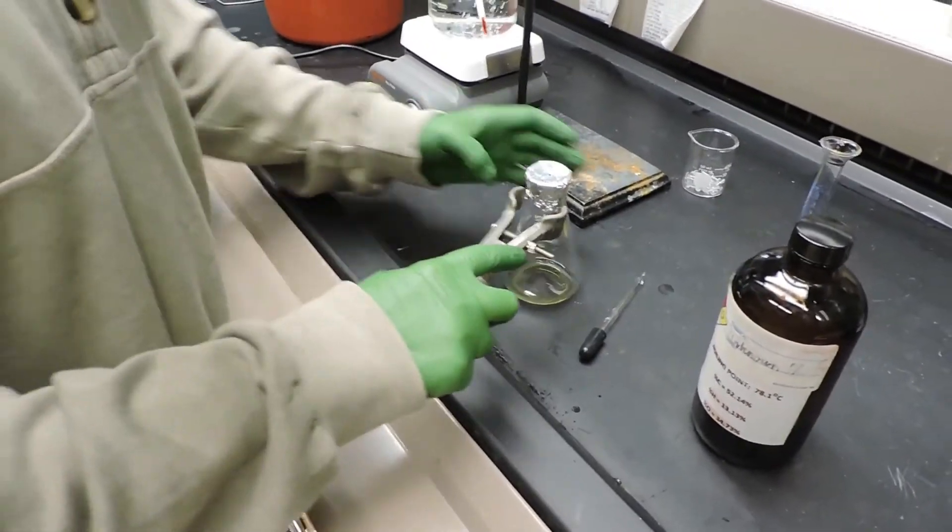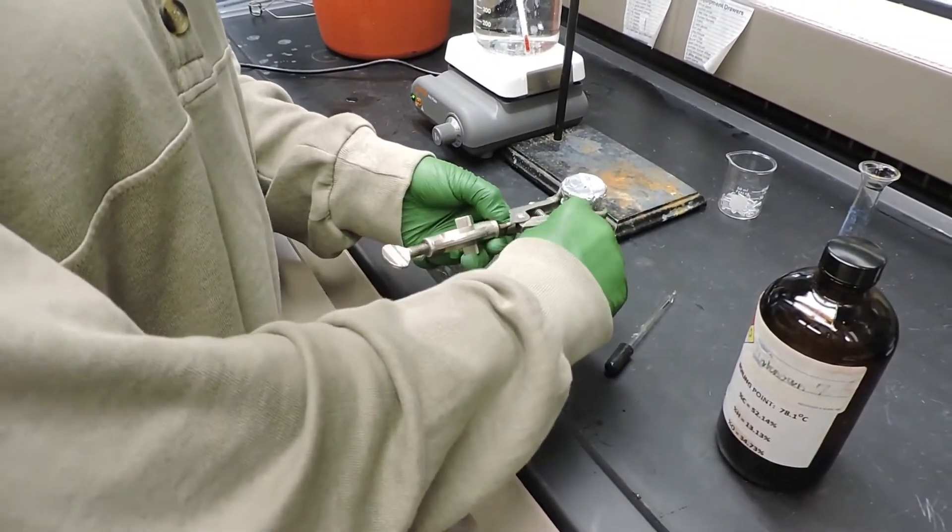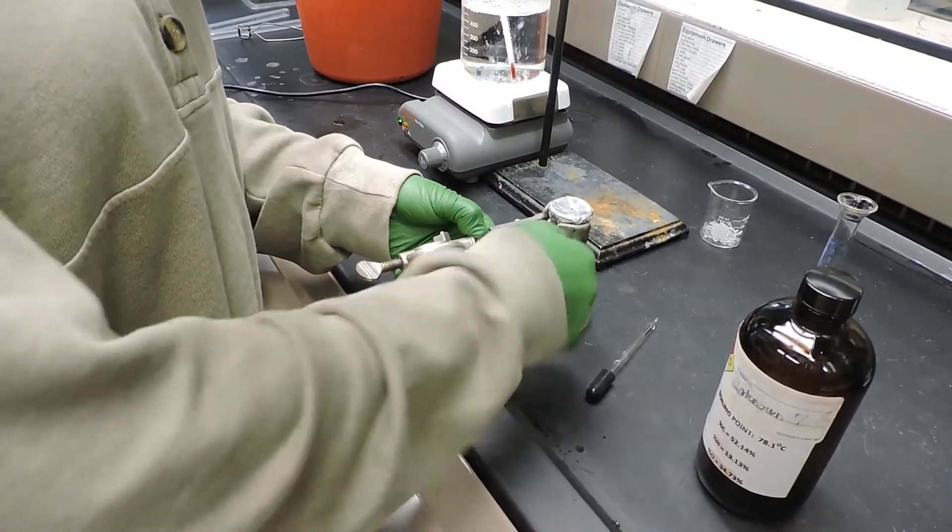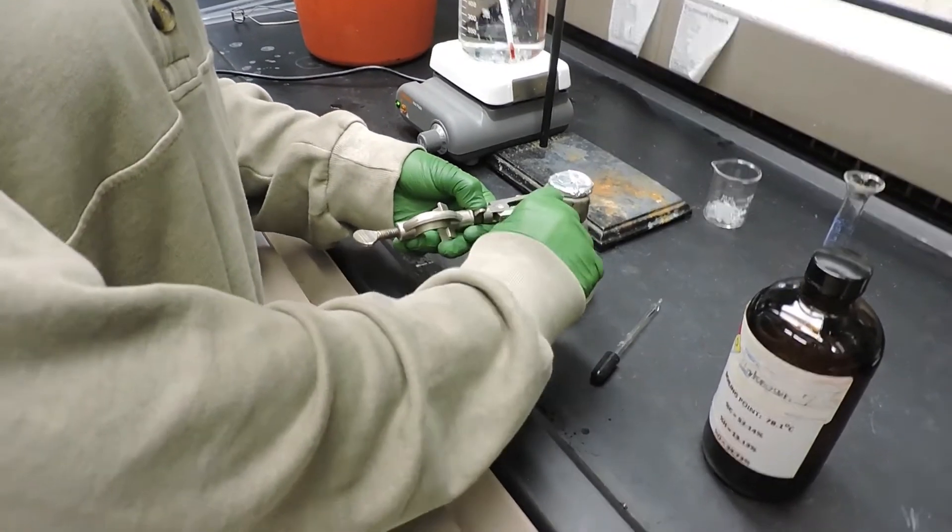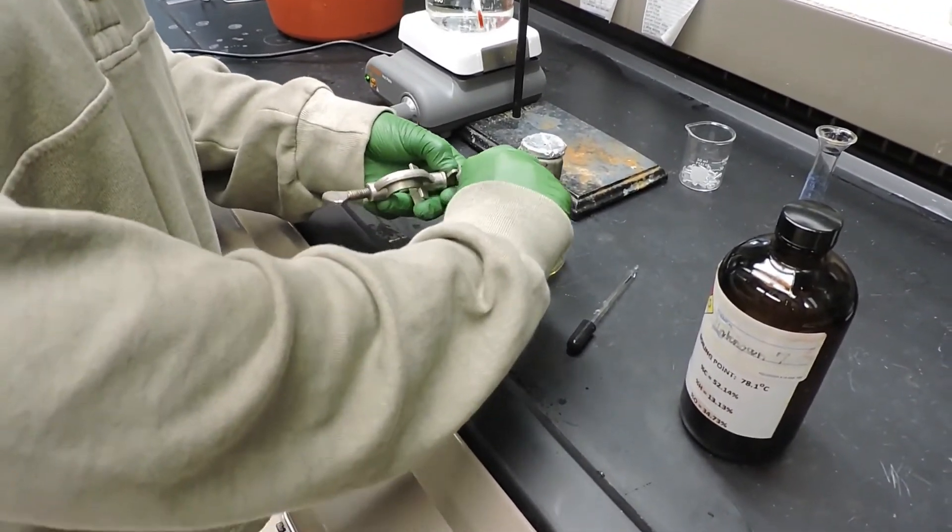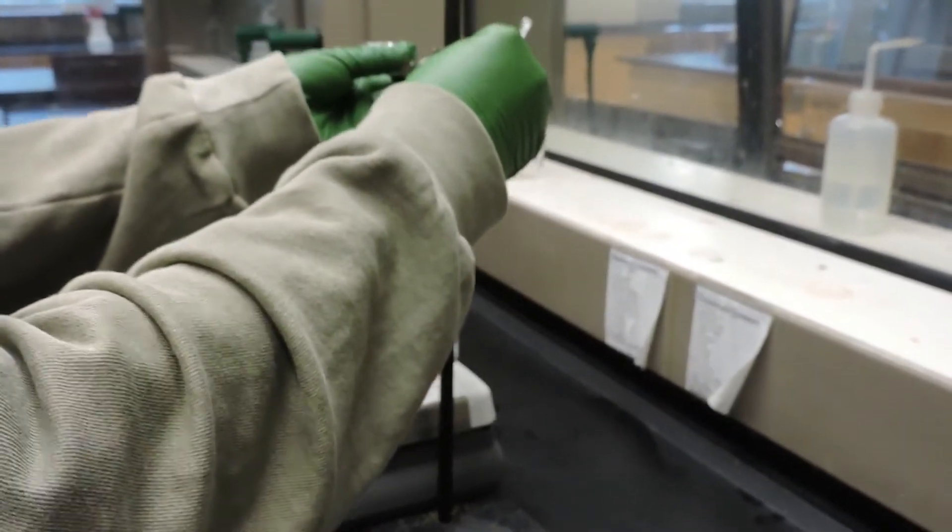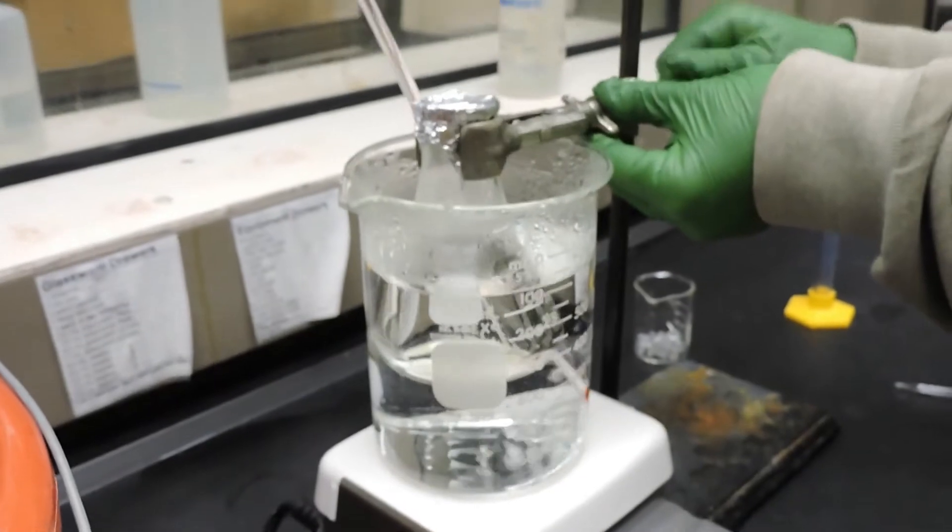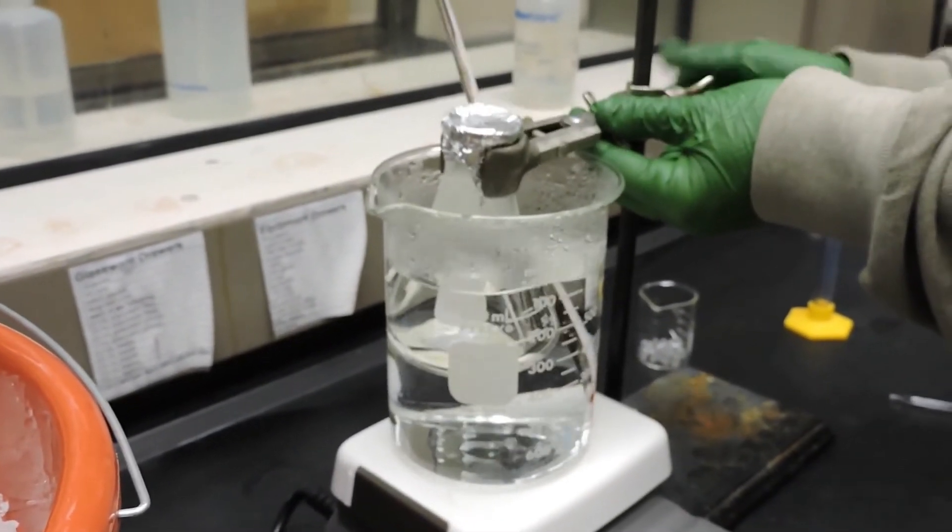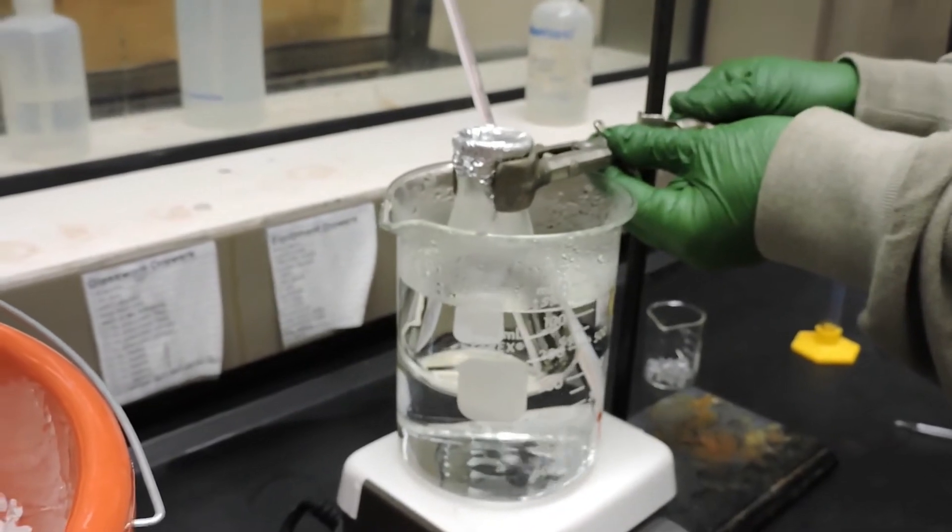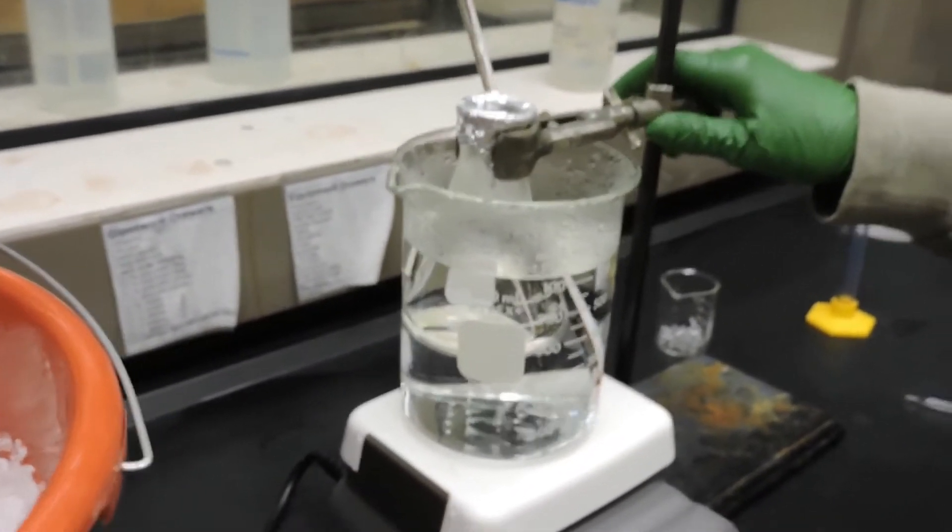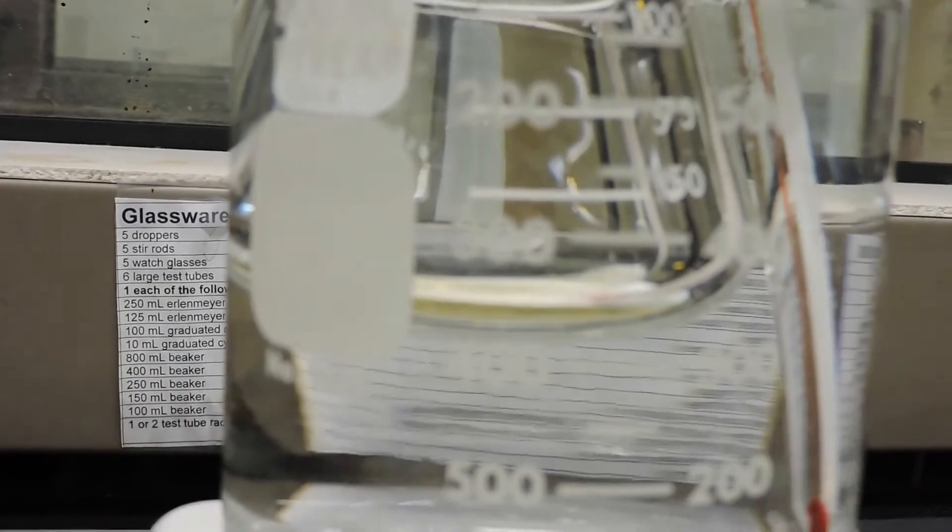We'll clamp the Erlenmeyer flask into the 100 degree Celsius water bath, submerging the flask as much as possible without getting any water or vapor in the flask. We will heat the solution inside until it has completely evaporated.